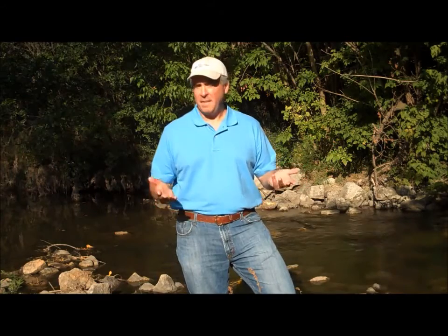It would be really impossible to try and teach all the tests right in the class with one teacher and 26 students doing a variety of 10 different water quality tests. This way you can find it on the YouTube tape, become an expert, take your notes, and go for it. We're going to try and do ecological science, not just learn about it.